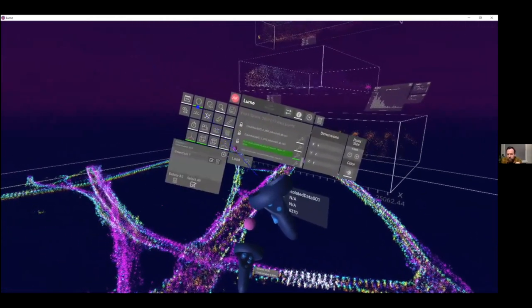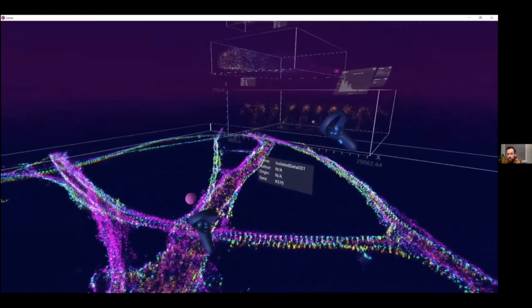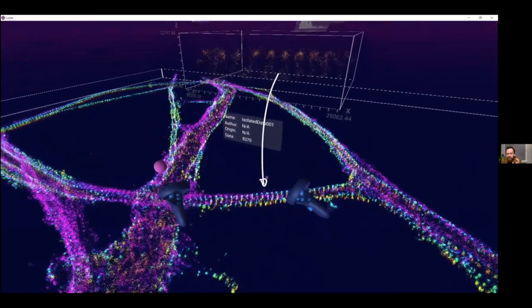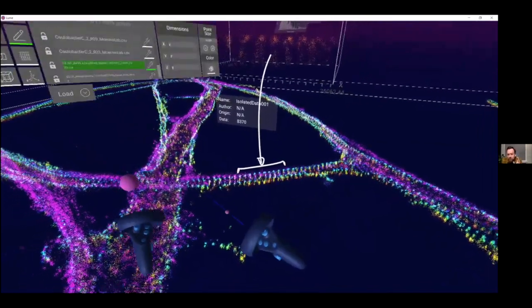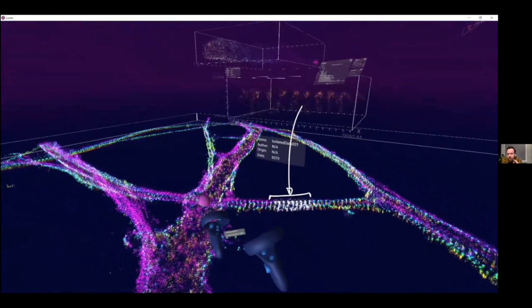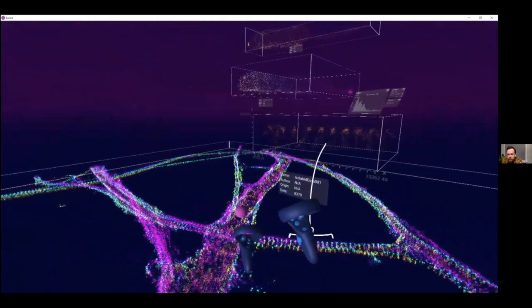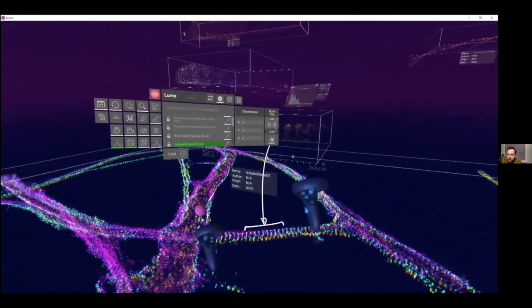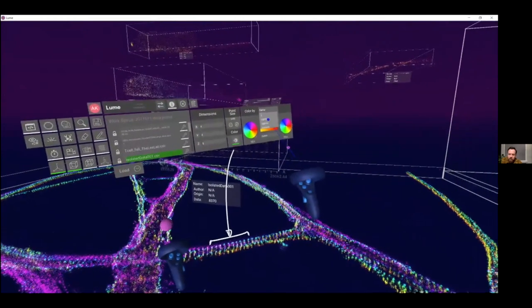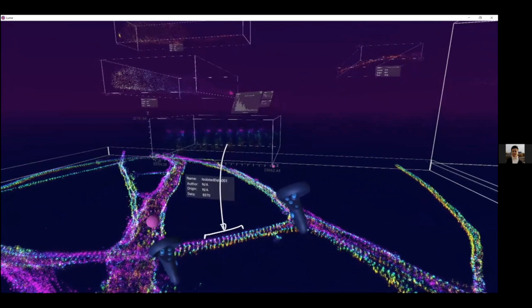Certainly the software here, vLUME, will be capable of doing it once we go back in the lab and work really hard to be able to do that. And we have certainly some ideas about how to do that. So that's certainly a place we want to go into the future. But these are static three-dimensional images of, in this case, a neuron, but also the T cell membrane that Alex was just showing. It's fantastic. It's really beautiful.